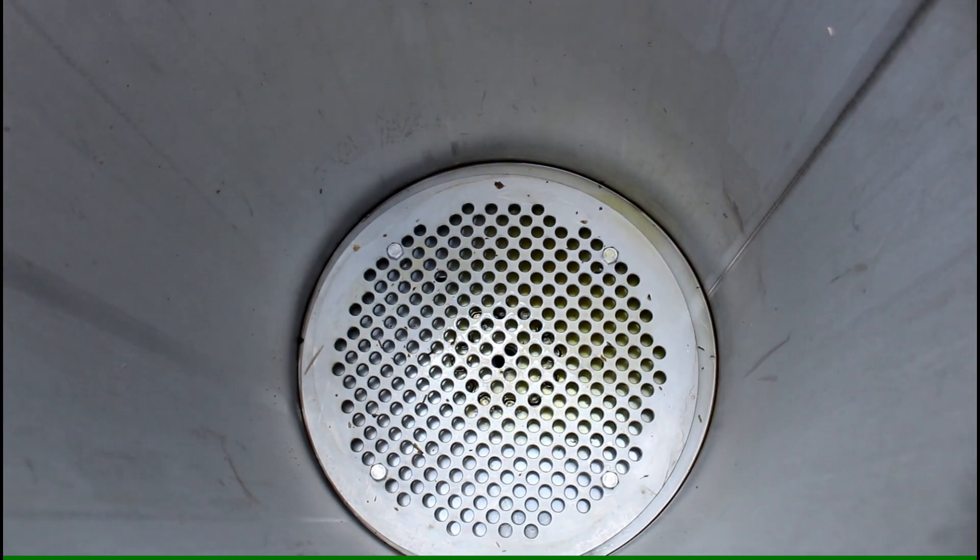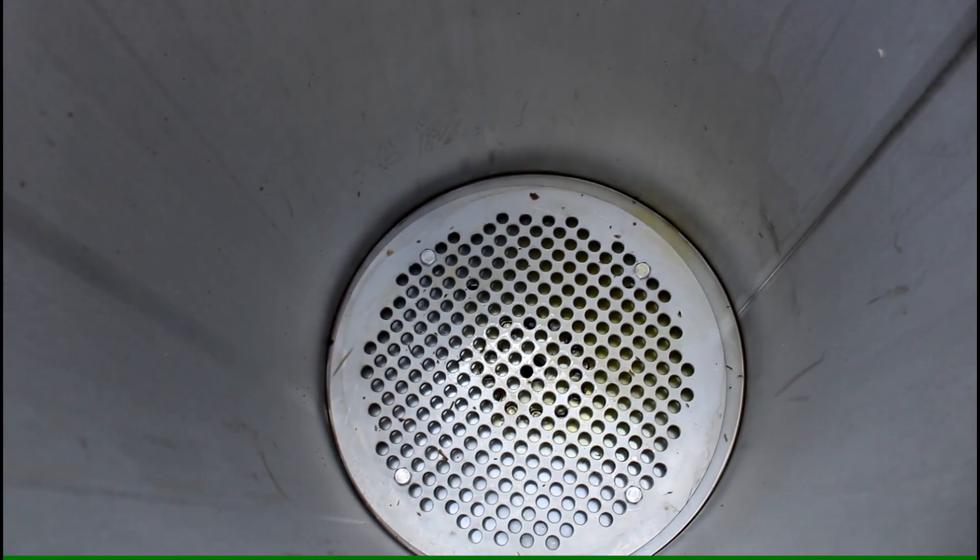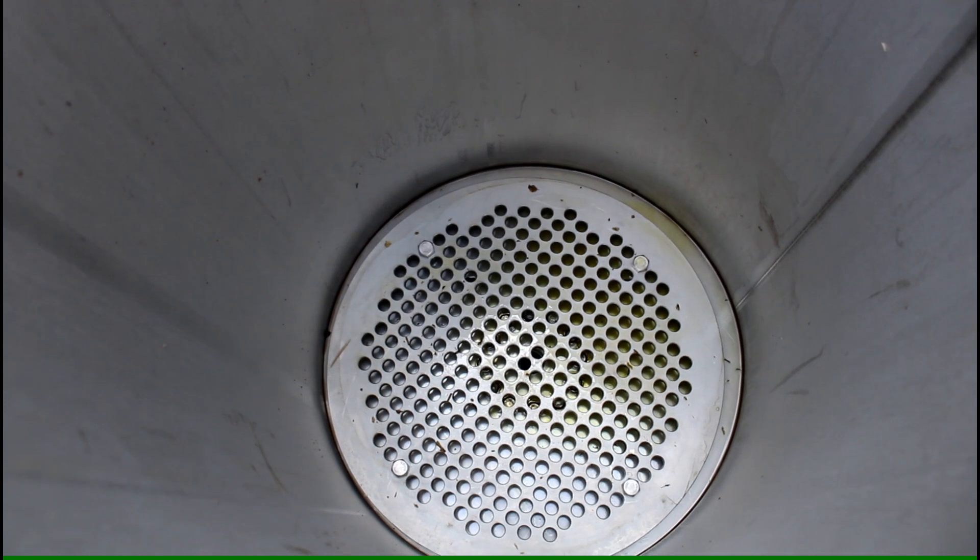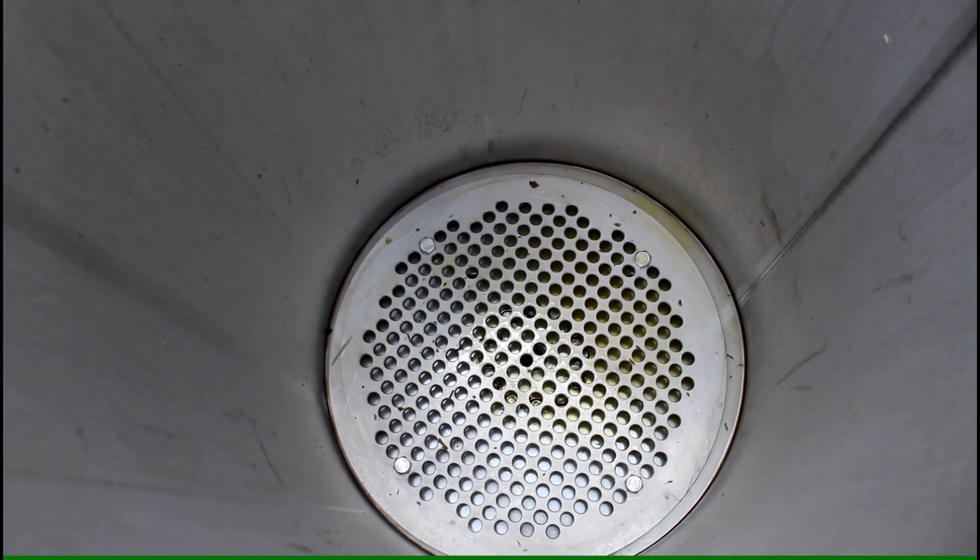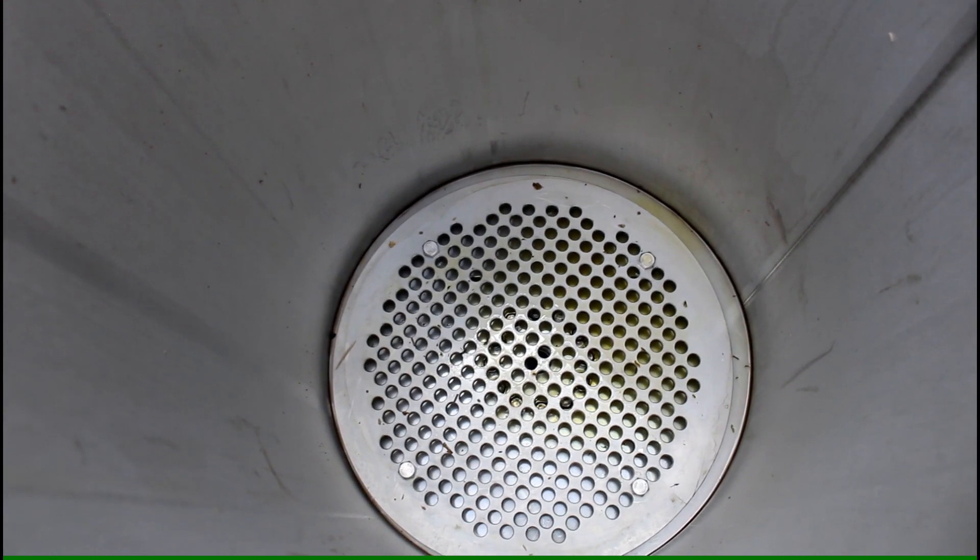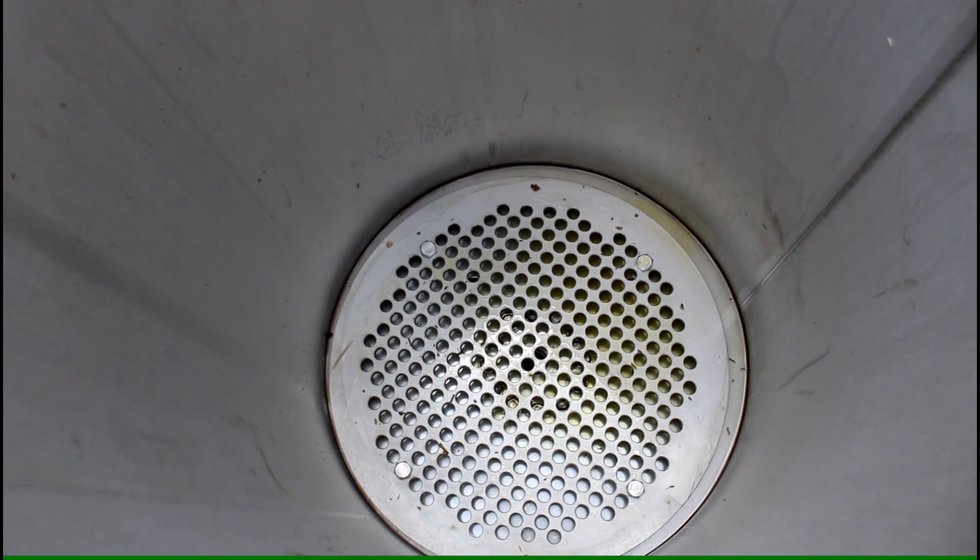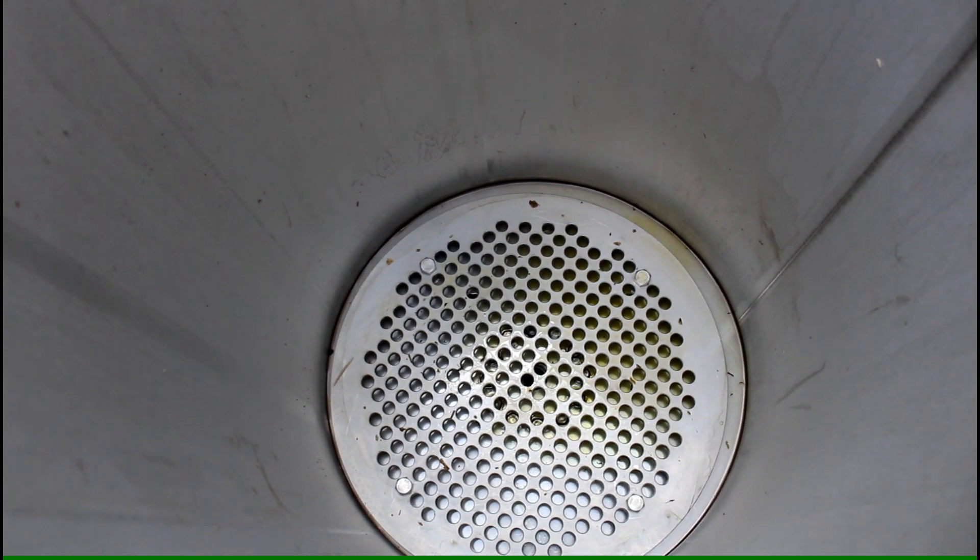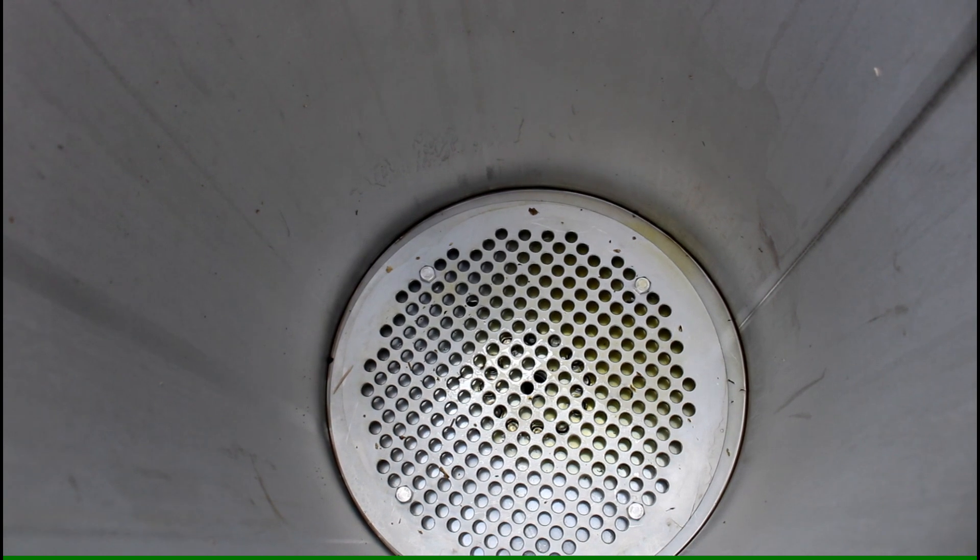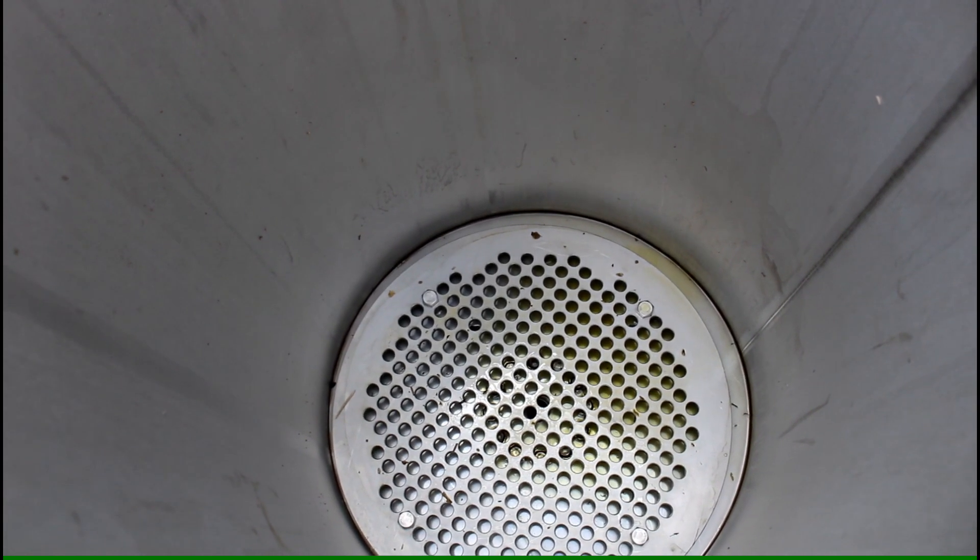Now let's have a look inside these herbal extraction tanks here. You see at the bottom there is a sort of metal plate with lots of holes inside. This is because if for example the herbs would just be totally on the bottom, they would clog up the system and there would be no flow through.